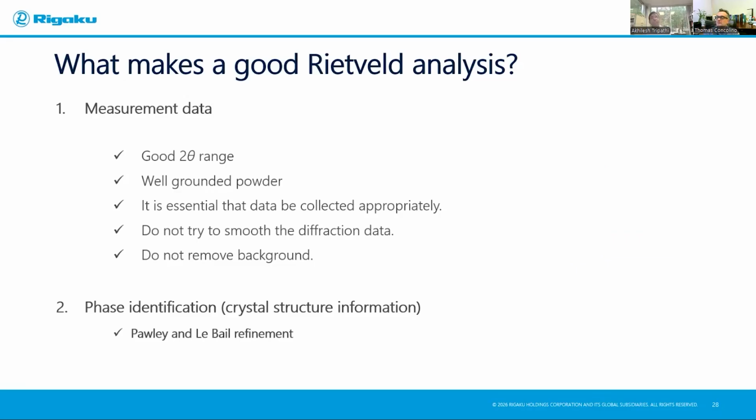So now we are going to talk about Rietveld. Over my 30 years of career in this direction, I've seen Rietveld is often underutilized, if I may use that word, which means it's a very strong program, but you may not be using all the bells and whistles or all the functions that are within these programs. And I hope I can do it justice today to make people realize the power of this program to get the best results out of it.